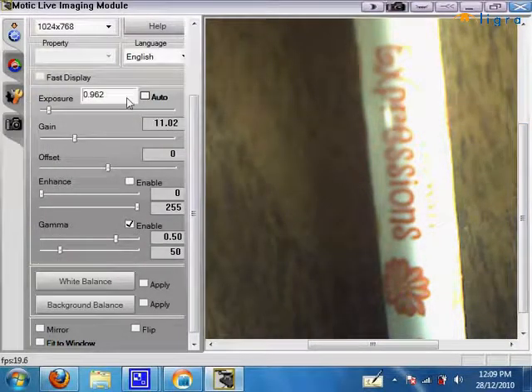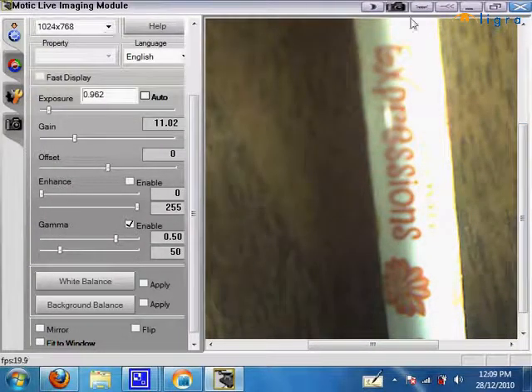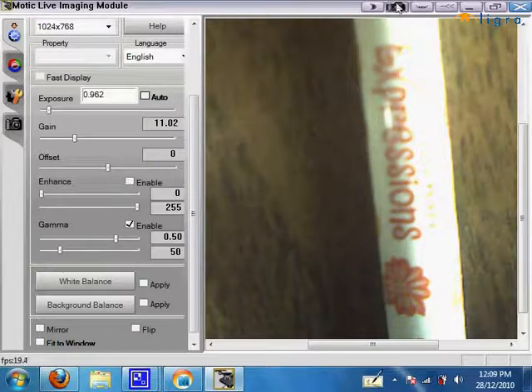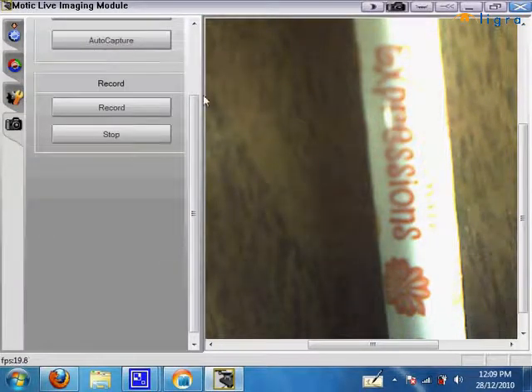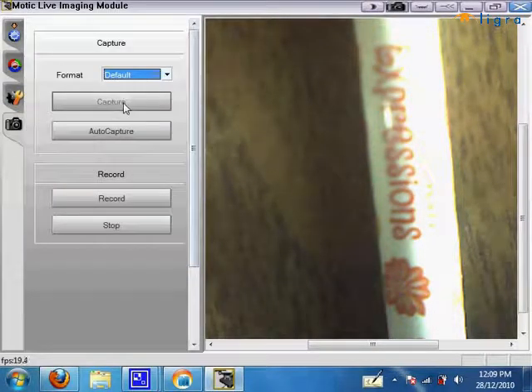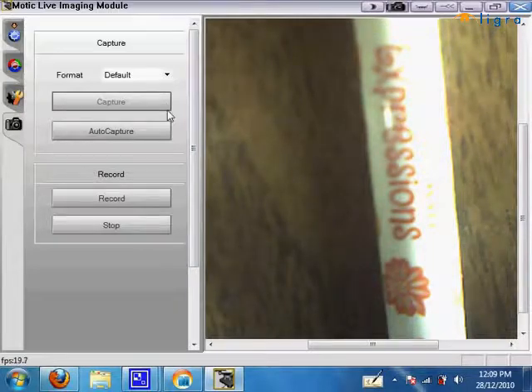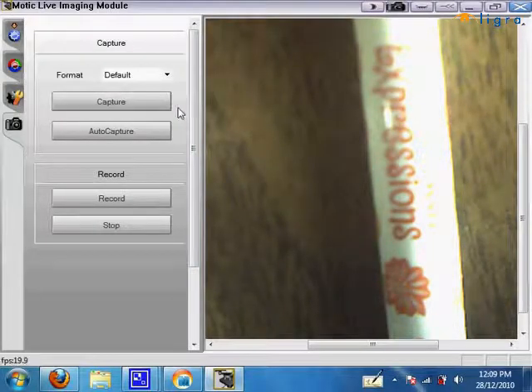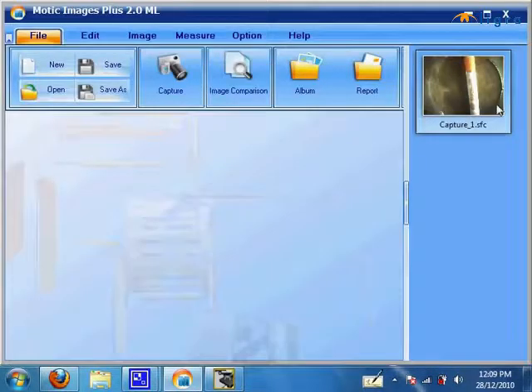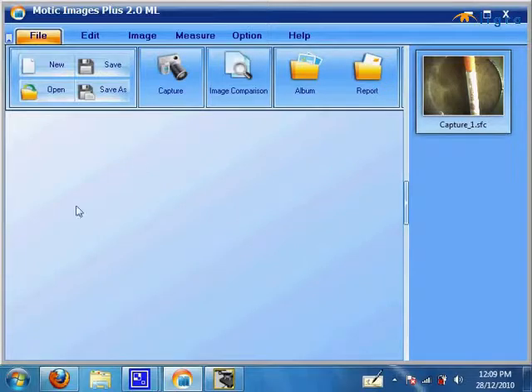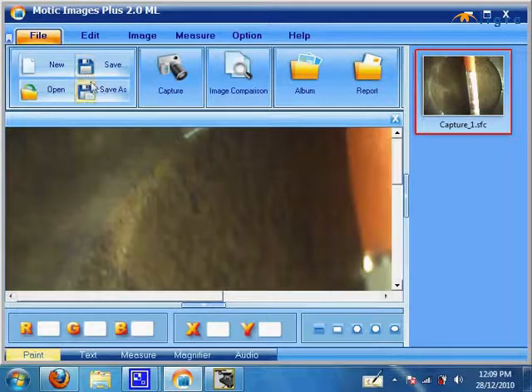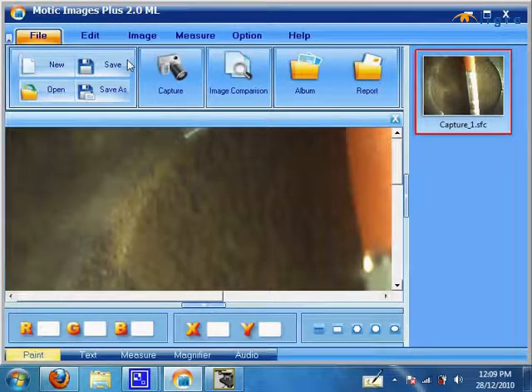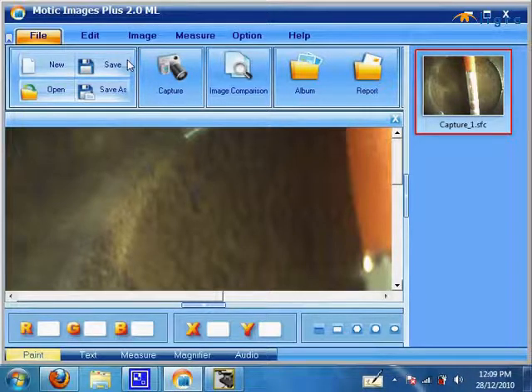Once you're ready to take your picture, you can click on this capture button here or the capture button over here. And once that's captured, it should show up on your main Motic Manager Plus window, which you can then save to wherever you want. And that's how to get your Motic Microscope or Motic Moticam up and running.